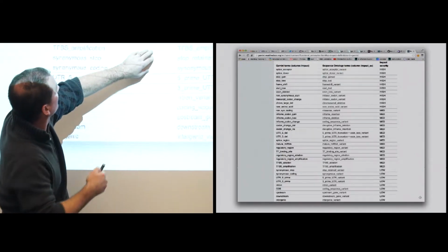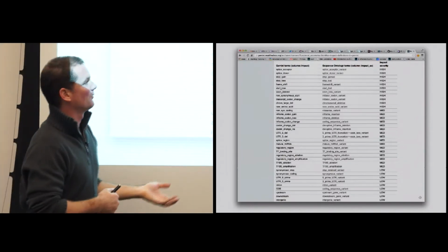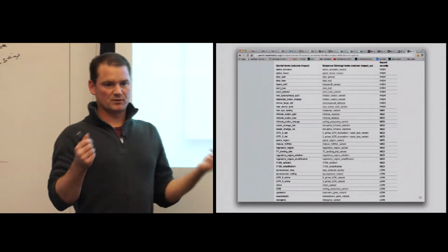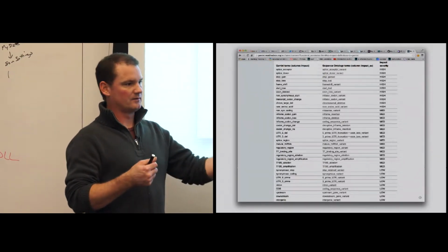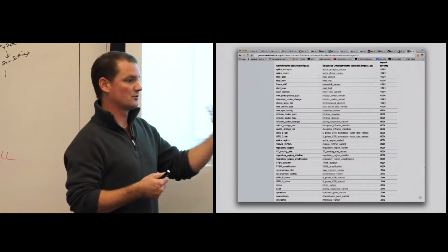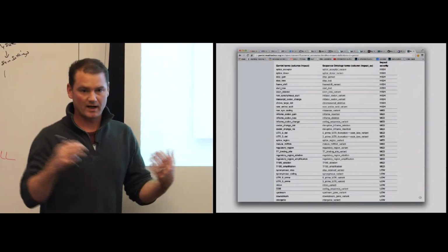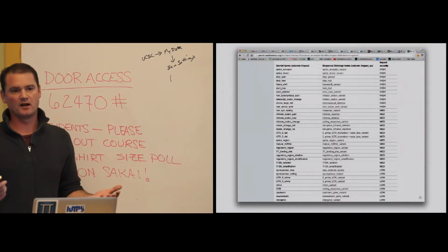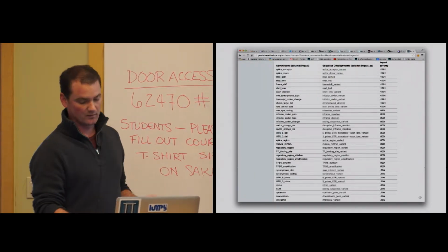Non-synonymous is up here somewhere, I can't see it. Stop gain, stop loss. And the reason that this was an important project is that previously tools had their own nomenclature. So, VEP would call a non-synonymous variant maybe a missense change. Another tool would call it non-synonymous. Another tool would maybe call it something else. So when you're trying to compare and contrast these different methods, it becomes pretty ugly because there's not always a one-to-one relationship between the description from one tool and another.